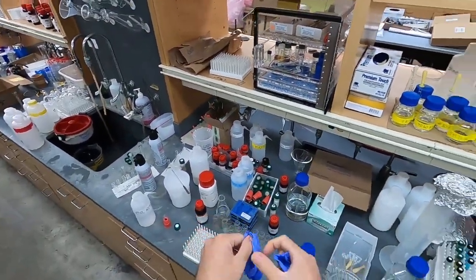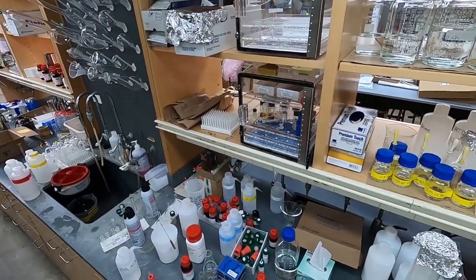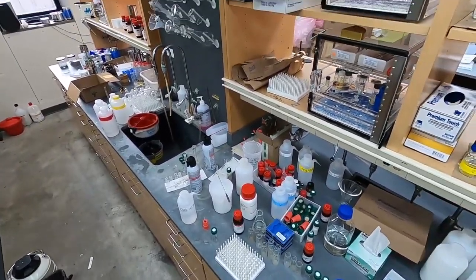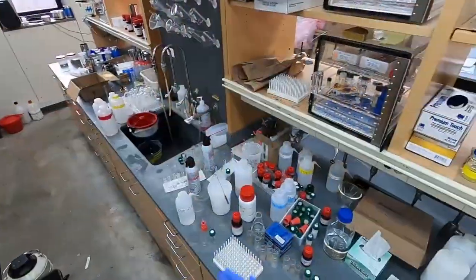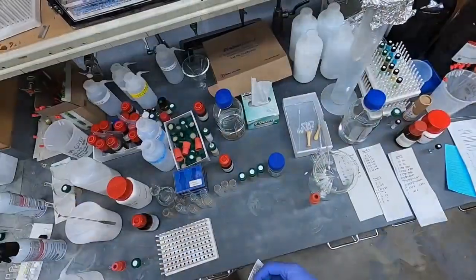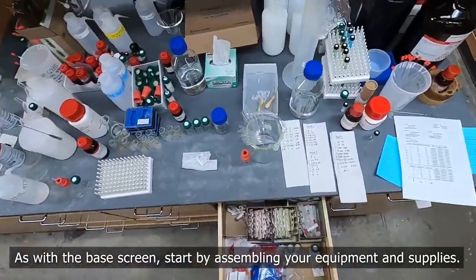And so now that we have our conditions, we know which base to use, we are ready to set up the larger scale reaction and get that product so we can isolate it, make sure we're making the right compound, and gonna get all of our tools ready here for the glove box.